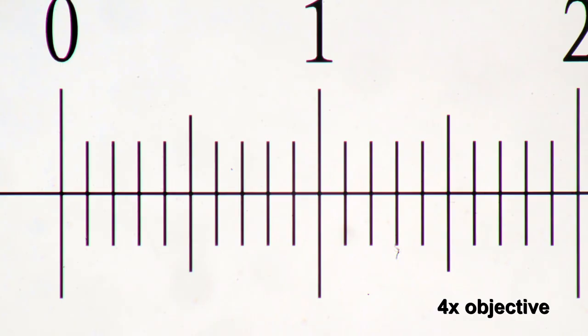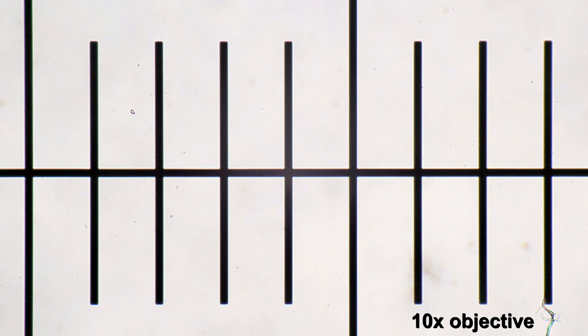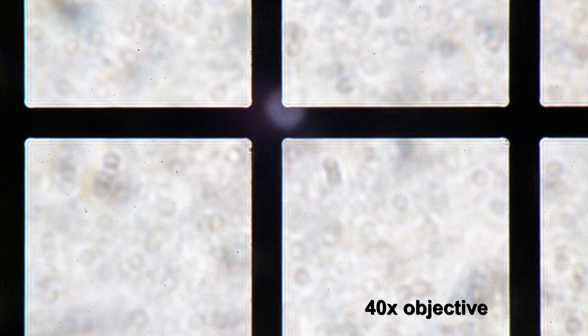So this is, in the lower right corner, you see the objective that I was always using. So that's a four times objective, ten times objective. It's pretty self-explanatory. And the lines are quite thin, so that's pretty good, but they're not infinitely thin. So later I'm going to show you how you can actually measure out the distance, even though the lines themselves have a thickness. This here we already start to see a little bit of dust, unfortunately. And this one is, the last one is quite interesting. We can already see a little bit at the edges, a little bit of diffraction patterns.